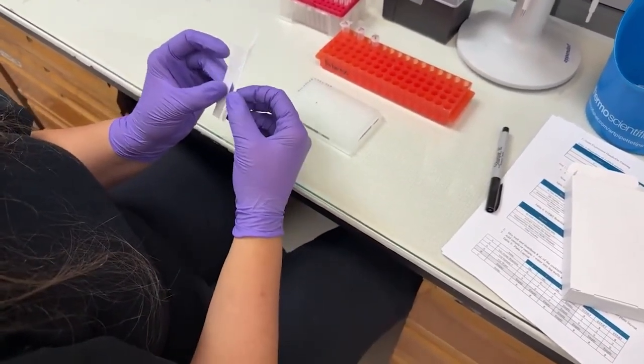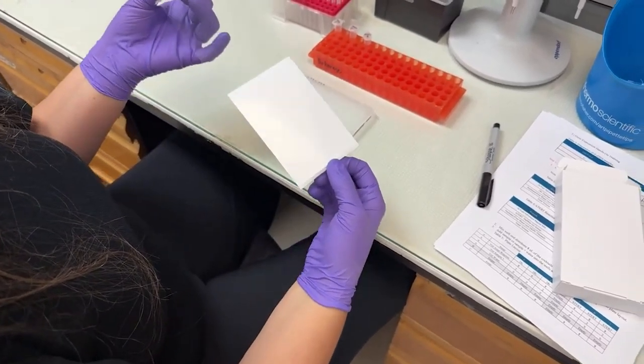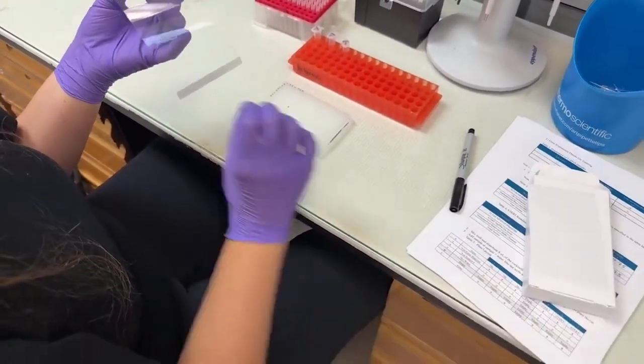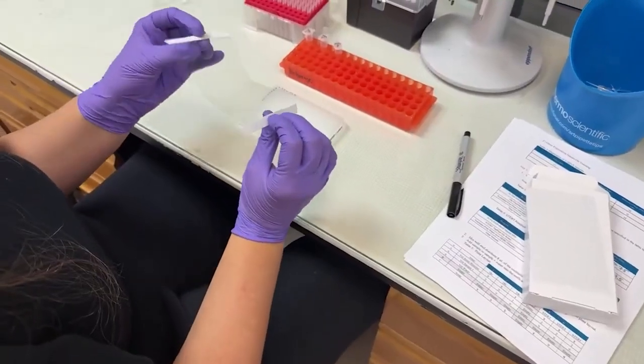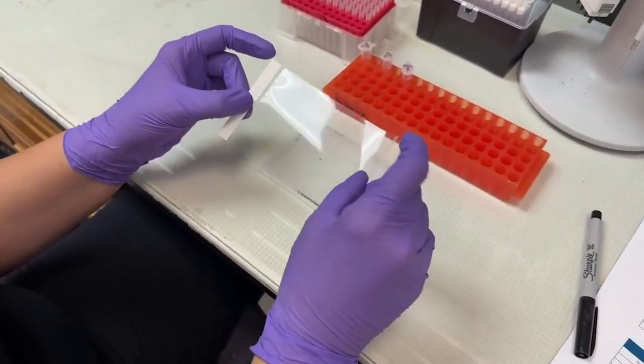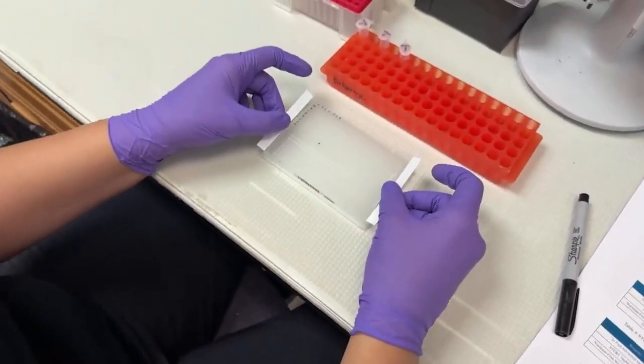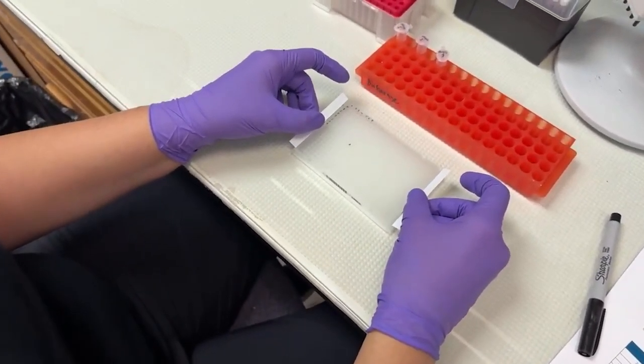So if I separate this, I can take off the backing. I'm going to hold on to these end tabs. And it's going to be kind of hard to see, but each one of those, right where it's perforated. So what I'm going to do is line that up as best I can.